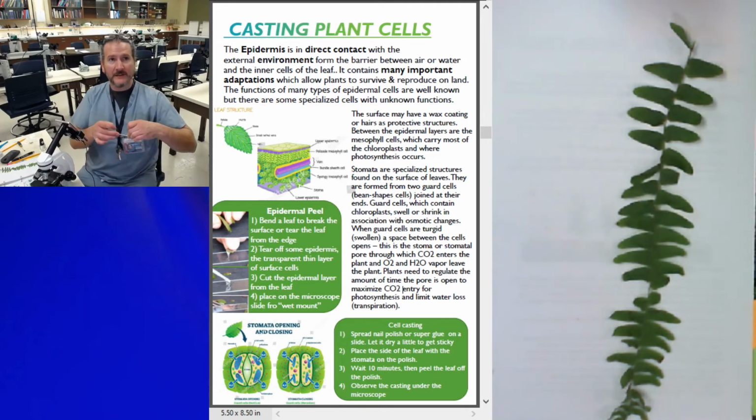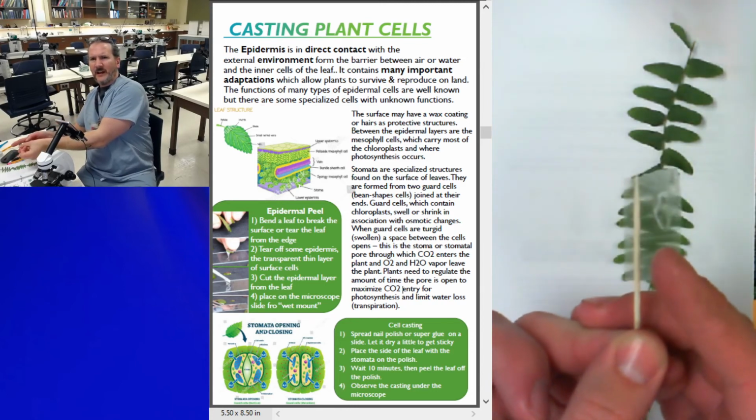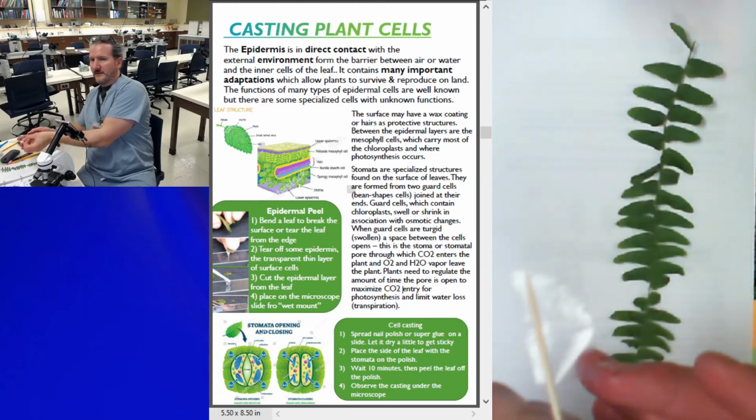Okay, so I put this on a toothpick, just like that. You see the outline of the leaf, right?